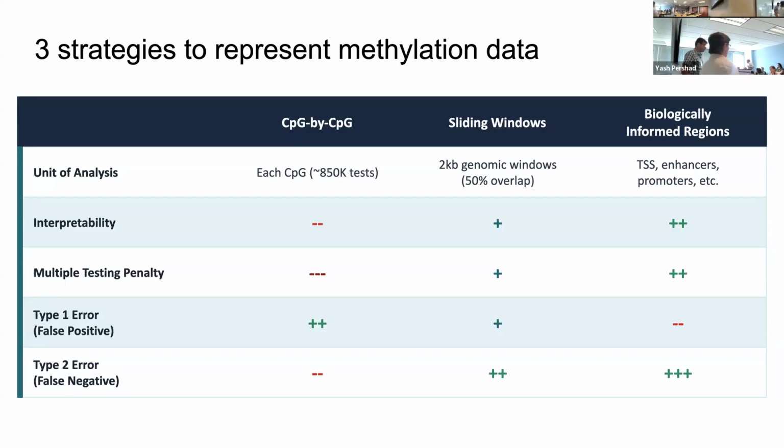The reason I think you would want to do this is if you had paired gene expression data. You can do it with gene expression data that's not totally paired from the same population, or otherwise. But if you had paired gene expression data from the same sample, and you're looking at promoter methylation or enhancer methylation and associating that with genes, that's a really great reason to define that promoter 2 kb up from a transcription start site, and then ask if the methylation in that region predicts gene expression.